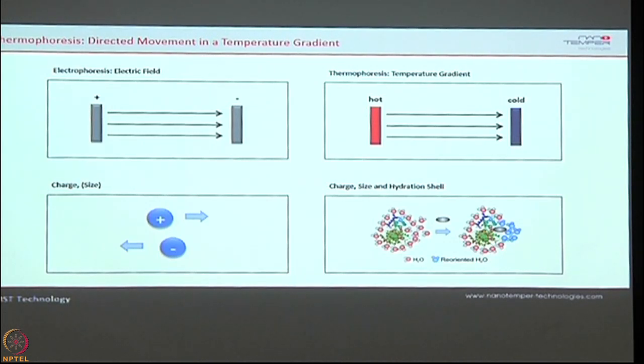Normally when a protein binds, the size changes. When a protein binds DNA, the charge changes. And when a protein binds a small molecule, the charge or size may not change, but still a water molecule is displaced upon the binding. So it all depends on how it is binding. This technique has become very sensitive to all these three parameters, and there will be a change in the thermophoresis behavior when there is any change in these parameters.